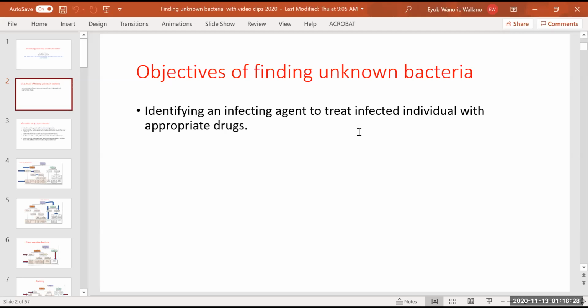And then you are going to do the fermentative process. Why? Because the one which you have done on three stages, gram, spore, and acid fast, you need to accompany it, make it proof or make it perfect, so that the analysis is exact to prescribe medication for a patient.